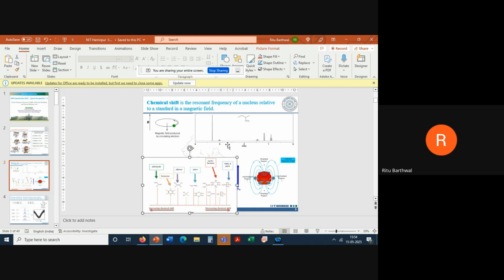Compare this with OD, optical density also. We get in OD a resonance peak because of tryptophan, tyrosine, like the full thing. Here we are getting peaks according to CH3, CH2. So we are working almost on atomic scale.